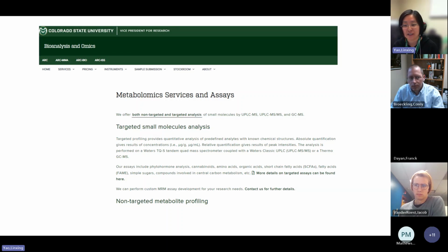It's case by case. For example, for estradiol, it's actually just a little bit of improvement compared to the ammonium hydroxide additive we use. And we know a compound like estradiol that has 2 hydroxy groups, one of them a phenolic group, doesn't behave well in ESI ionization, but you usually can get better results with negative mode ionization.